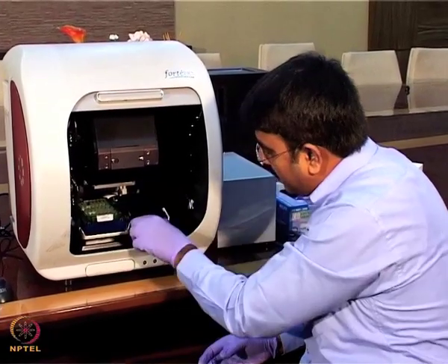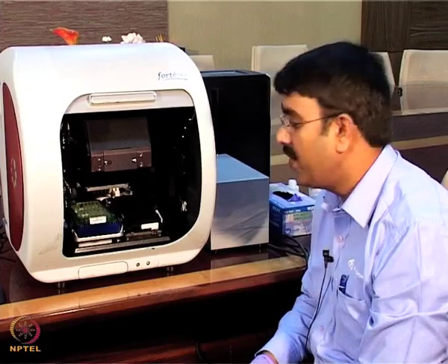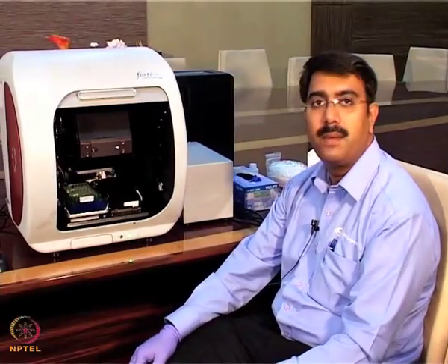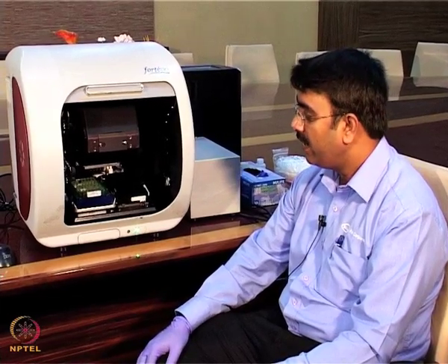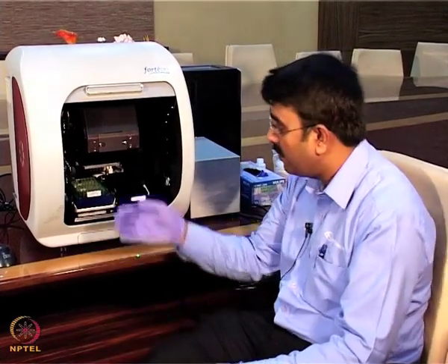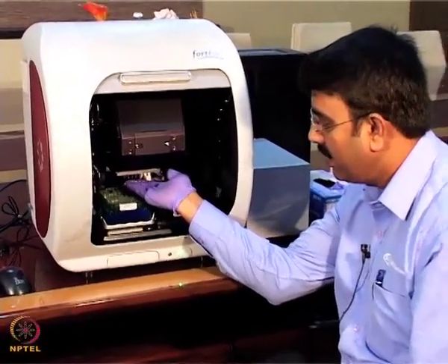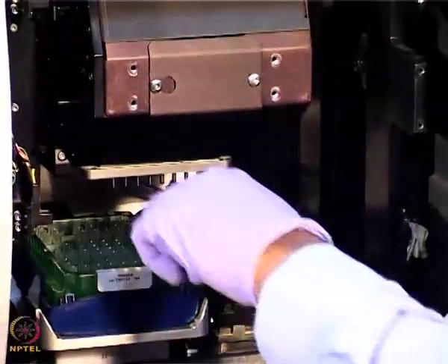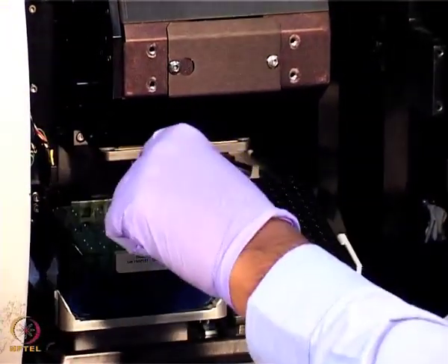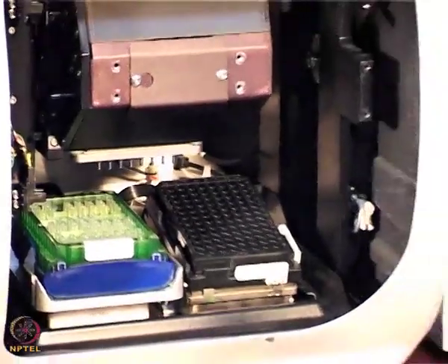This works on the principle of dip and read as well as bio-layer interferometry. You know about the principle behind bio-layer interferometry from the last talk. Here it consists of a white light. As you can see here, this is the white light, the light emitting diode. We are passing the light from the light emitting diode through the sensor. This is the sensor.